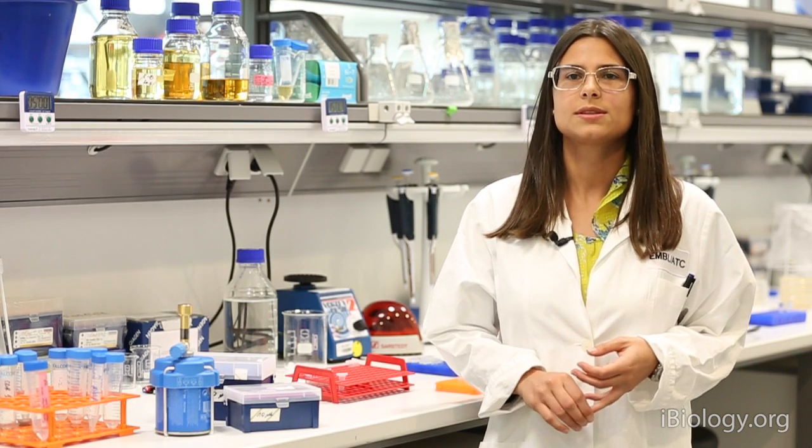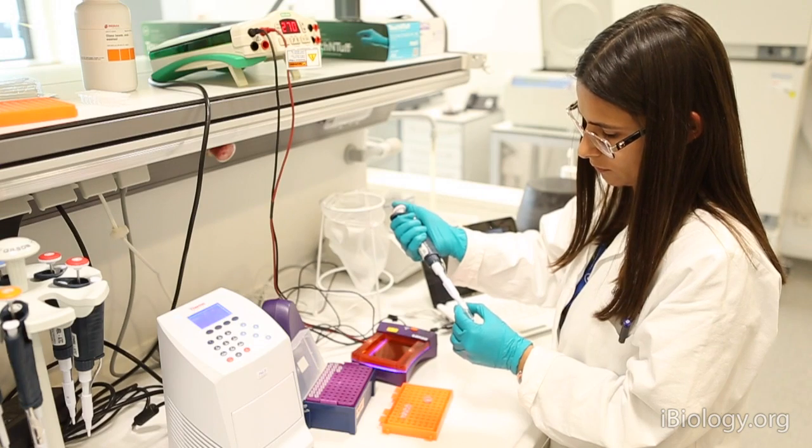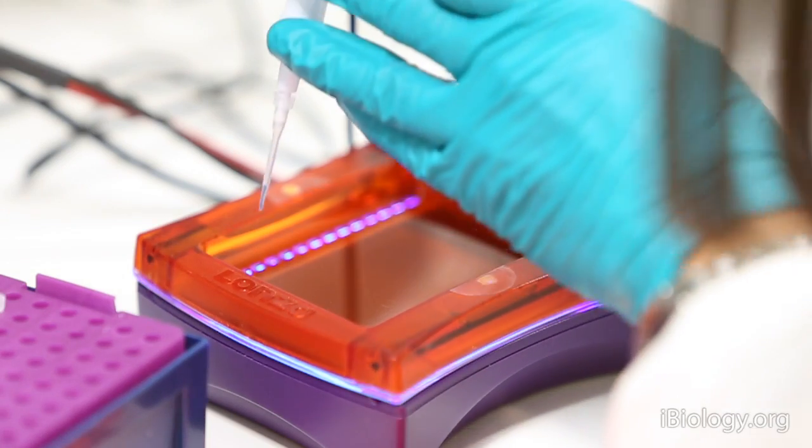Hi, I'm Joana, and as Nico told you, I will show you how we amplify the genes in the lab. Instead of amplifying the 2 genes that we want to introduce in Saccharomyces cerevisiae right from the strain that originally produces beta-carotene, we order them from a synthesis company, codon optimized to maximize the protein production levels in Saccharomyces cerevisiae.